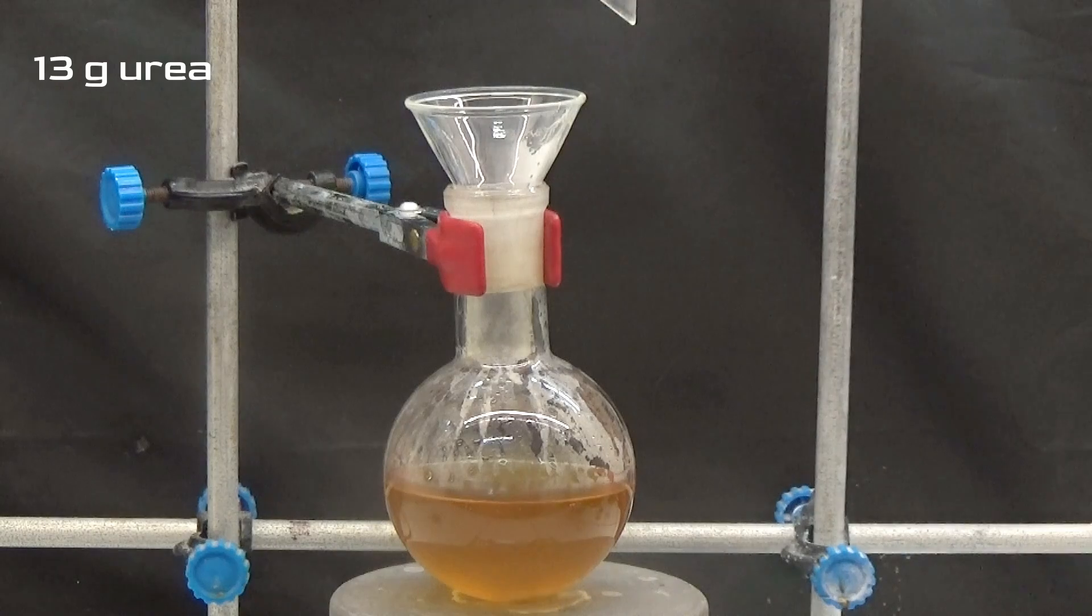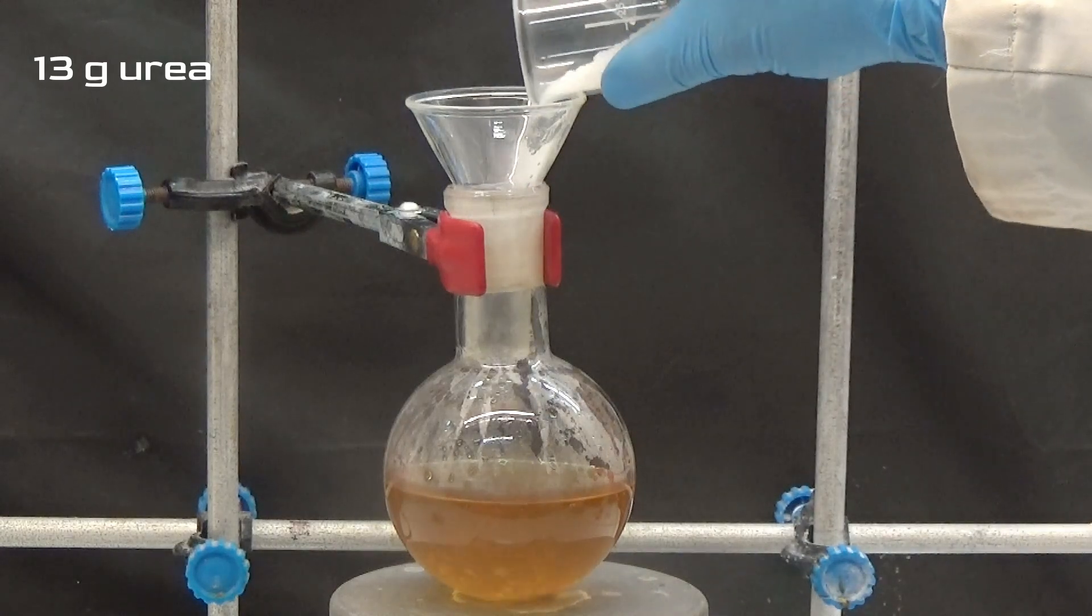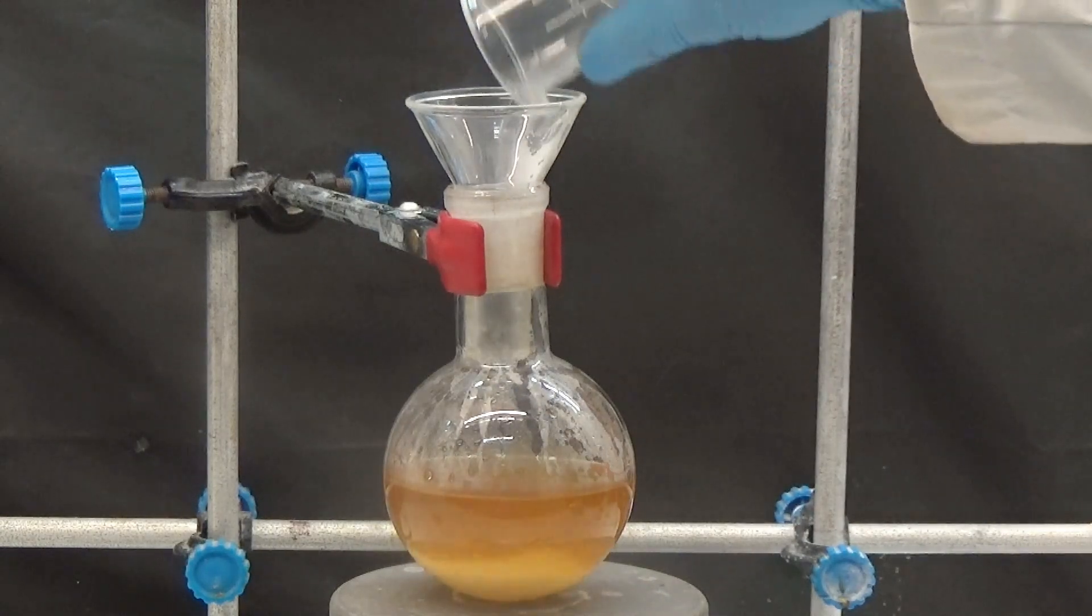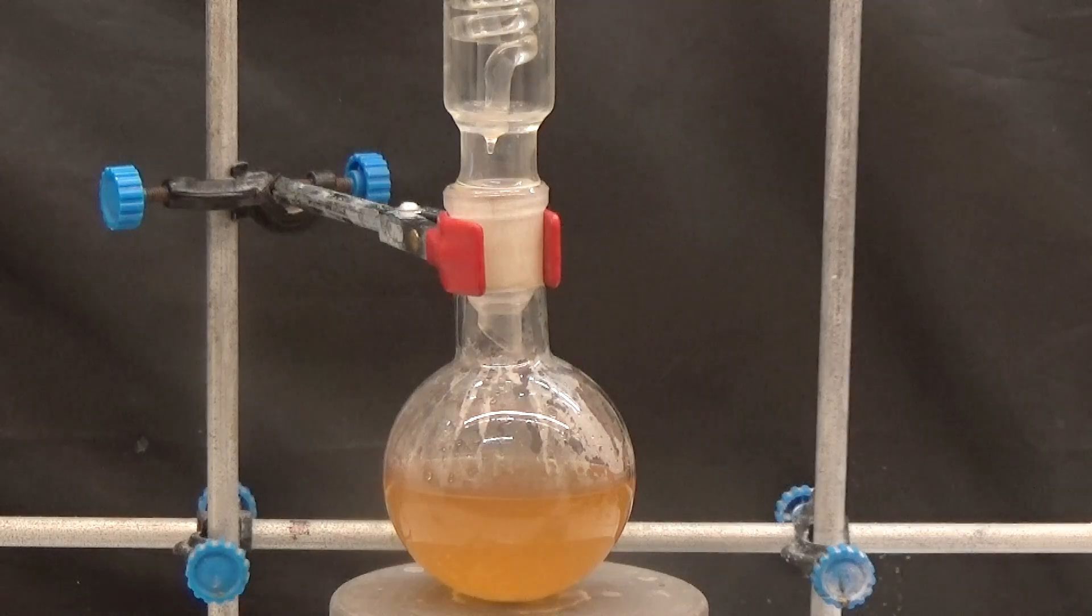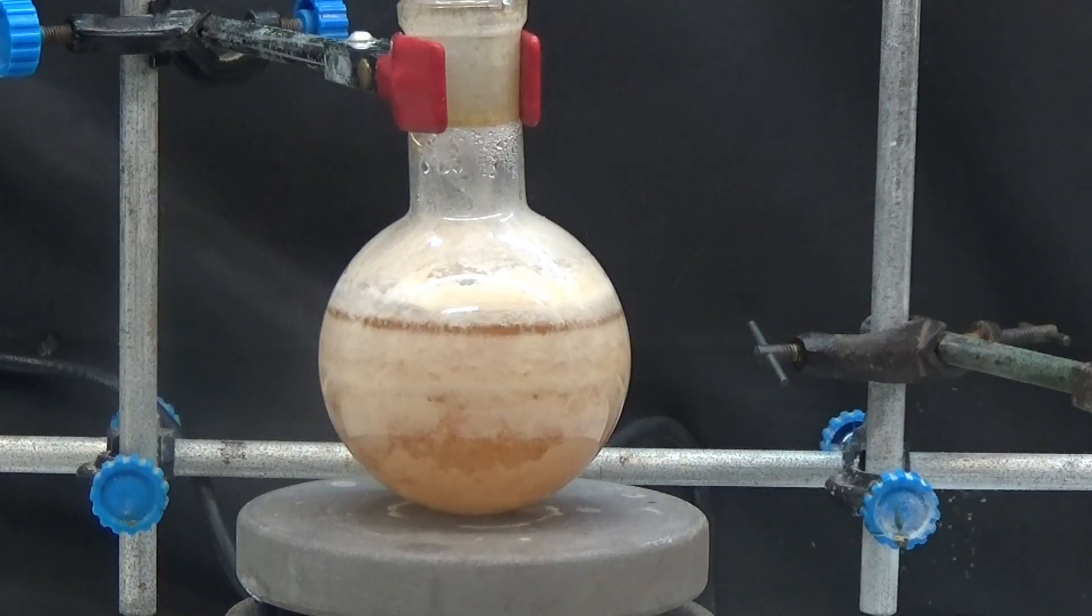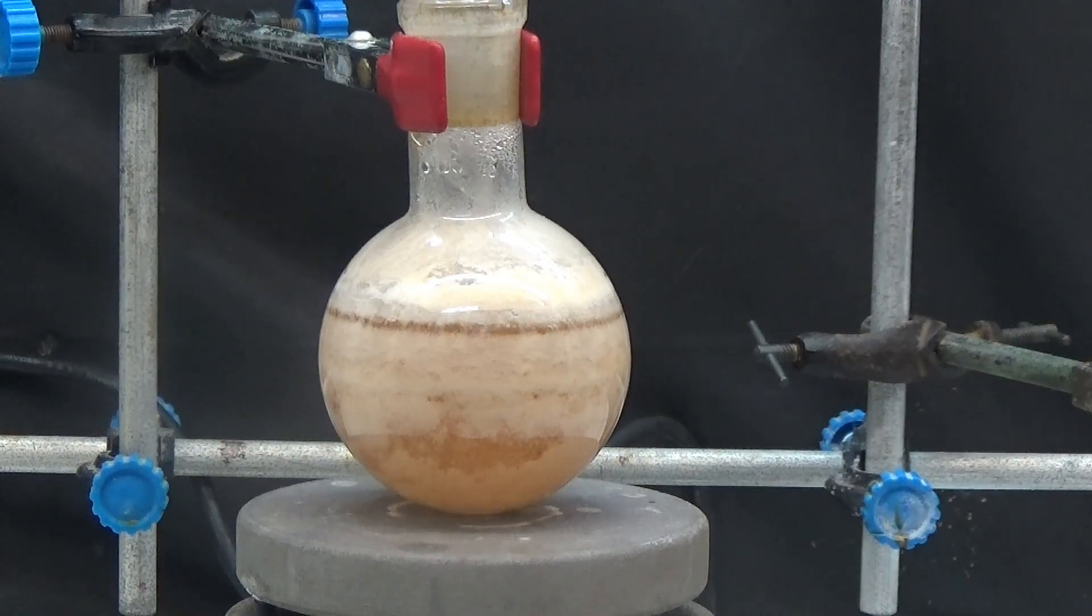Add 13 grams of urea after the hydrochloride is formed. Boil at reflux for 2 hours. The initial crystals of diphenylurea appear after 30 minutes of boiling.